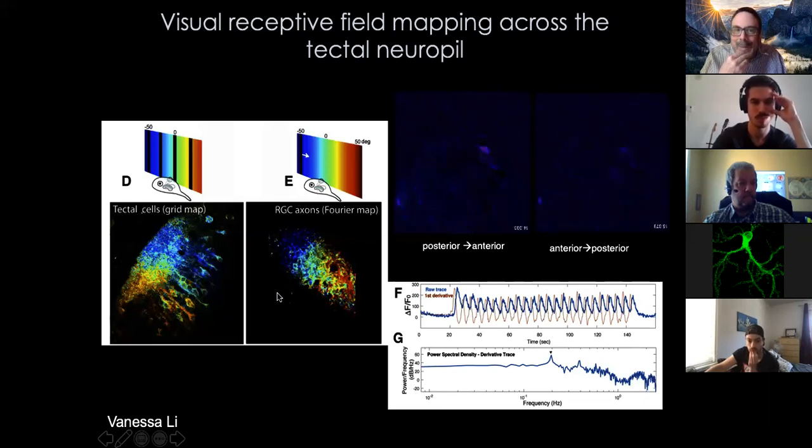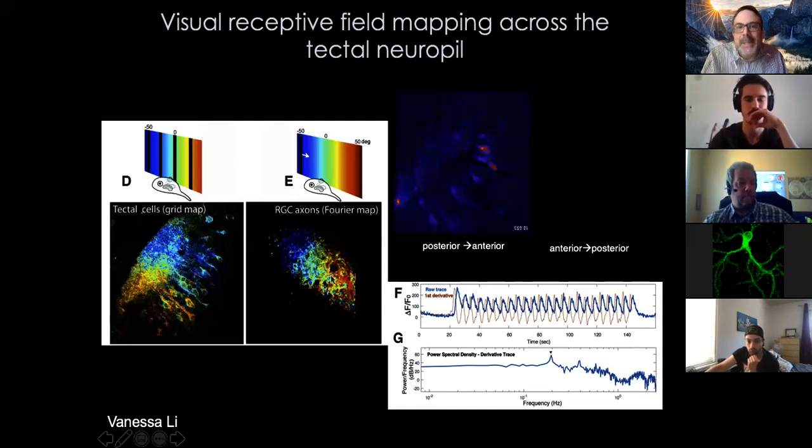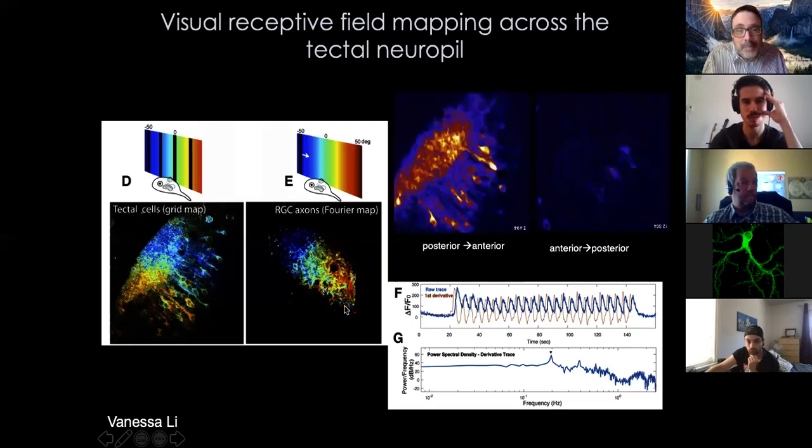And what's nice is that not only do we have the ability now to see maps at stages where, when people were using extracellular electrophysiological recordings in the old days, they would have claimed that there was no map simply because this structure is so small. This is probably 100, 150 microns in this axis and maybe 400 microns along this axis. And so the seeing distance of a typical extracellular recording electrode doesn't give you the resolution you need. But with optical approaches, we can see quite nicely.